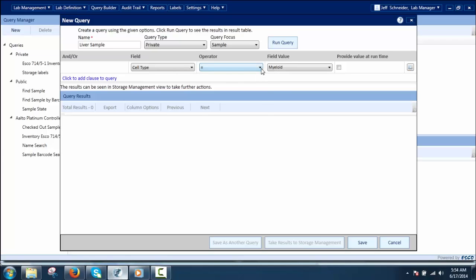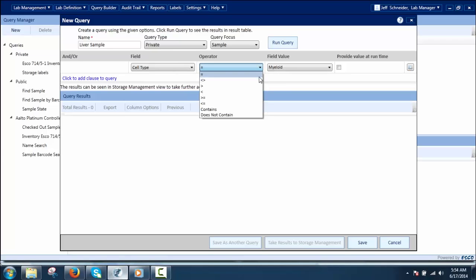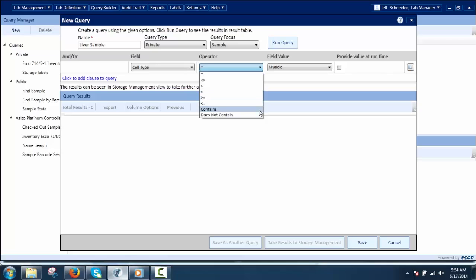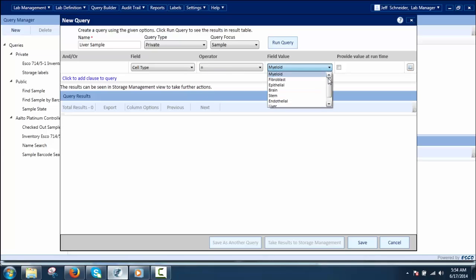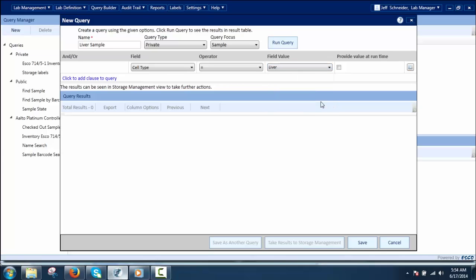Using operators, the user can define the query of interest with the listed fields. The system supports different types of operators. For field value, the user needs to define or select values for the selected field and operator in order to run a query.